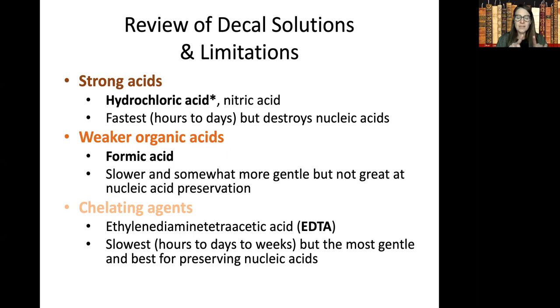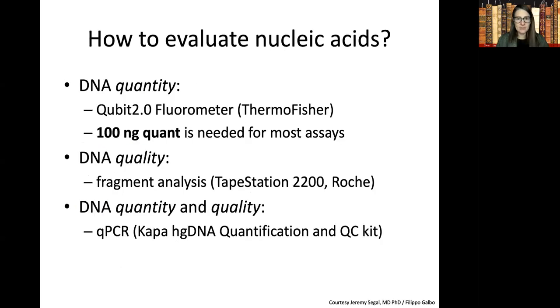And lastly, there are chelating agents, EDTA. I'm not even going to try to pronounce that. EDTA. It is the slowest, but it can take hours, mostly days, sometimes even weeks, but it is definitely the most gentle and best at preserving the nucleic acids. So you might ask, well, how do I know if a nucleic acid is good or not? Well, we did a trial.